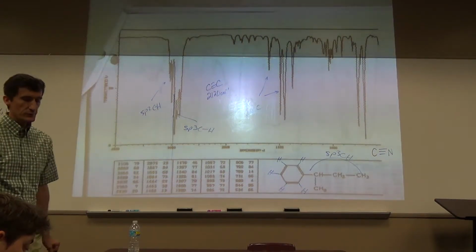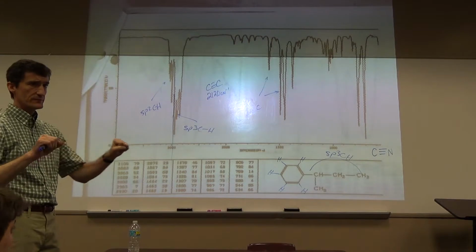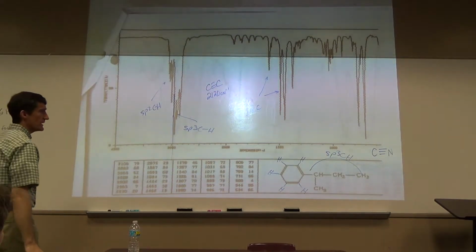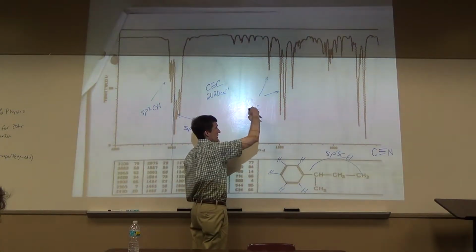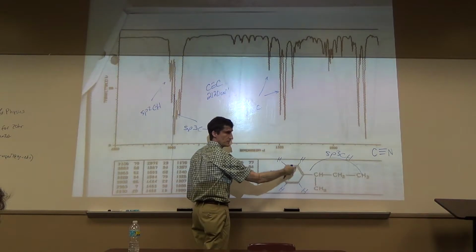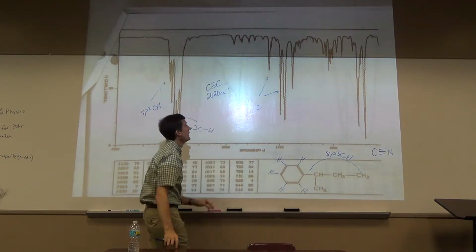Really, it's more than just the double bond. One of those peaks is probably coming from the ring doing some flexing. You can read about it. It's really just aromatic peaks, usually described as the double bonding. But actually there's more structural complication here, because this is an aromatic, it's completely delocalized.